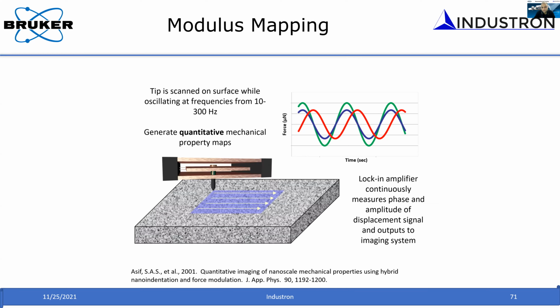So the next question is from Yanan Zhu, sorry if I pronounced it wrong. The question is, how do you get stress and strain information from nano DMA data? Well, stress is load divided by area, which is basically your hardness. Okay, we call it mean stress. And strain is basically displacement, right?